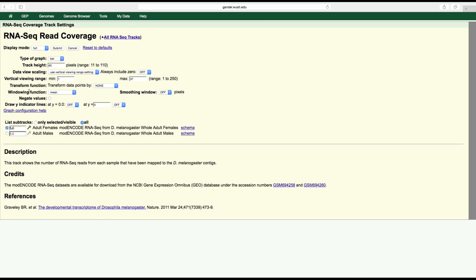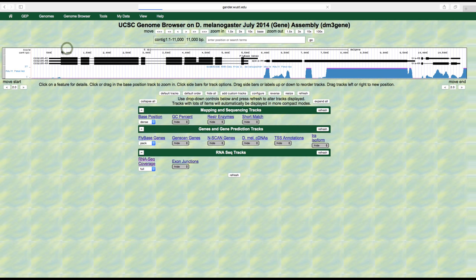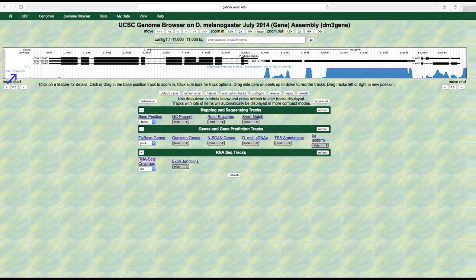Unselect the adult males track under the list subtracks section and then click submit. By unselecting the adult males option, the genome browser will only show the RNA-seq read coverage from the adult female sample. If we did not unselect the adult males option, the default would be to display both the female and male data as two separate subtracks on the genome browser.